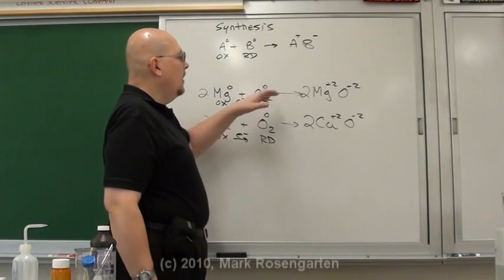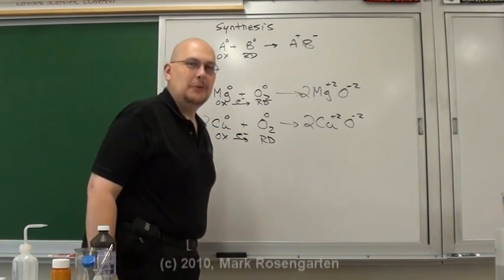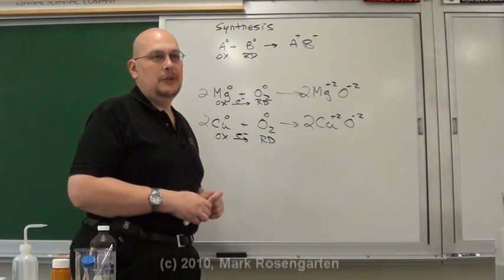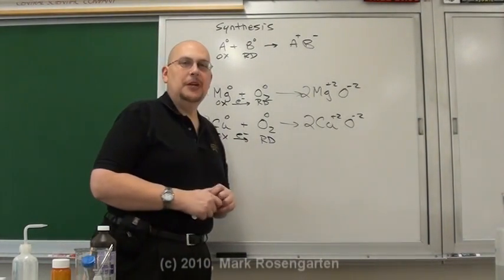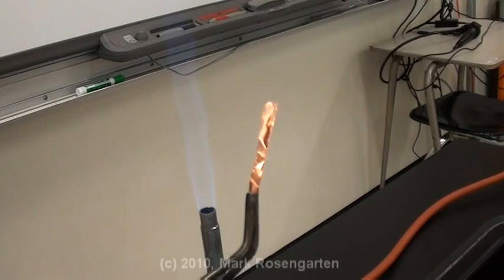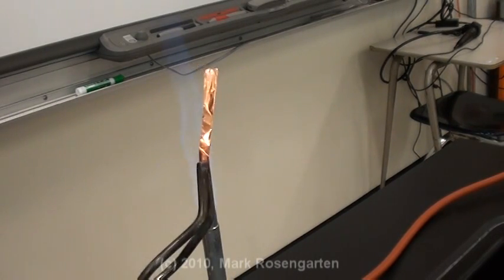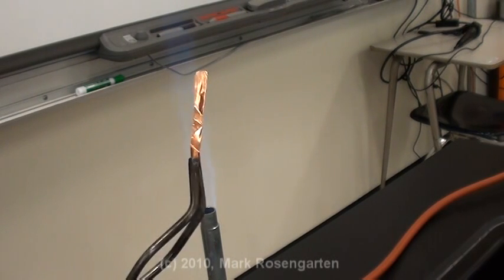Now as you're about to see, these two reactions do not proceed with the same amount of vigor. Each of them gives off a certain amount of energy when they react, and you'll be able to tell pretty clearly which one gives off more energy than the other. First we're going to react the copper with the oxygen by heating it up in a Bunsen burner flame.